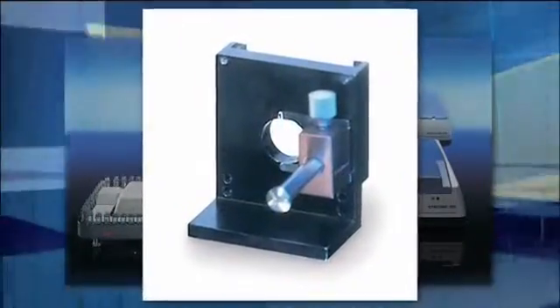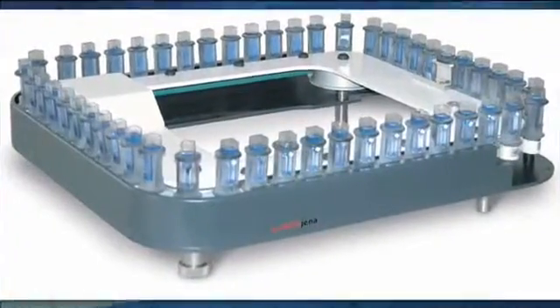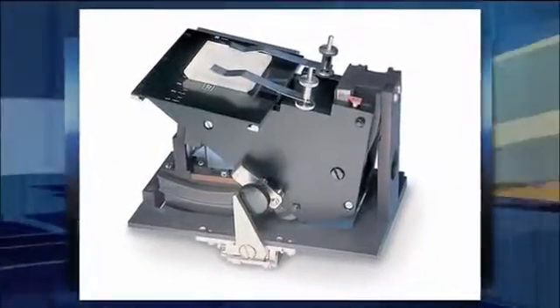All sorts of tasks in routine laboratories and research in faculties like chemistry, pharmacy, biochemistry, medicine, physics, and others can be tackled easily and extremely fast using the Spicord S600 spectrophotometer and the WinAspect software.